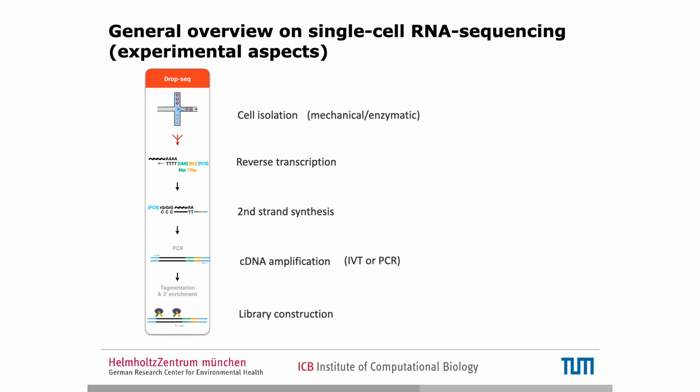Once we have gone through the amplification step, we can construct a library. Here the amplification step is critical when you talk about noise in single-cell RNA sequencing data. When you have the UMI, you can tell apart a real copy of a molecule that has been present in the cell from a technical copy that has just been created during the amplification step.